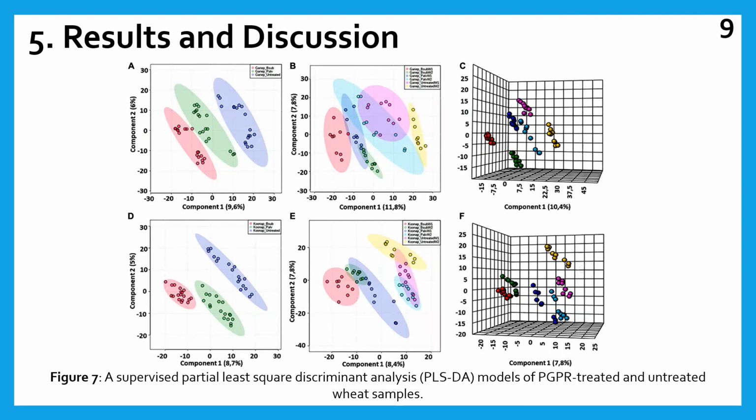So it's not necessarily a clear-cut case that because they are all plant growth promoting rhizobacteria, they should all secrete the same types of compounds, or the same quantities of compounds, that are beneficial to the plant. Here we're able to see that different PGPR strains or bacterial strains can produce different metabolites. They can also have different impacts on the plant itself, in terms of the classes of compounds they produce, and at what times those classes of compounds are secreted into the rhizosphere.